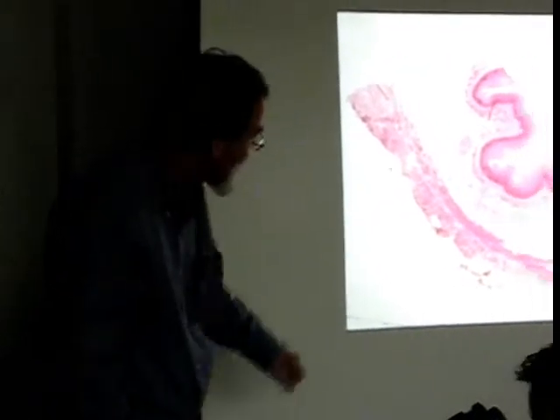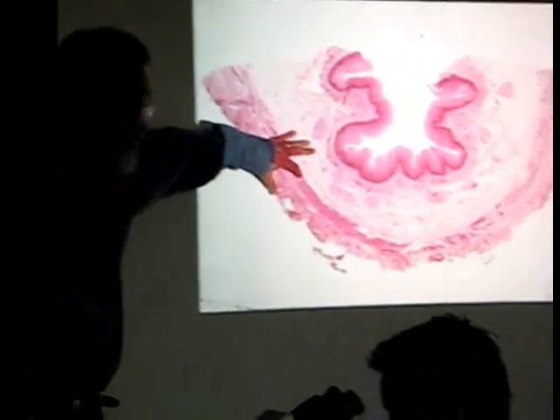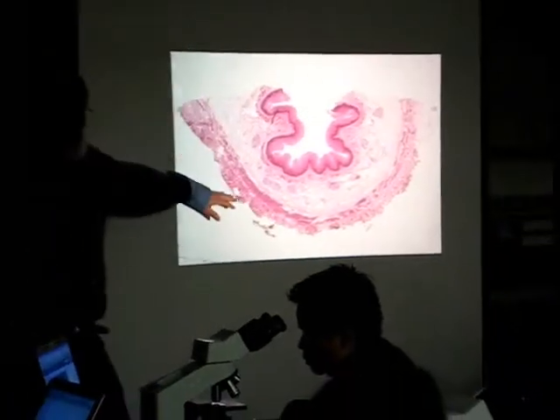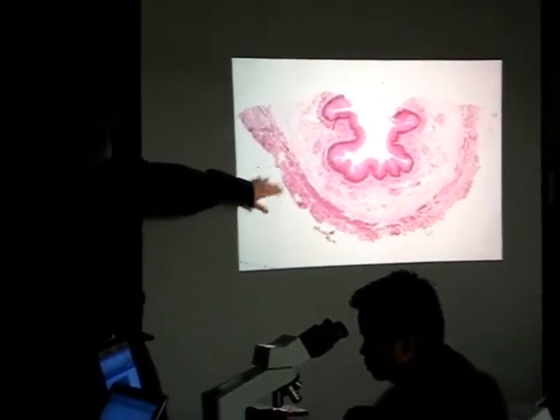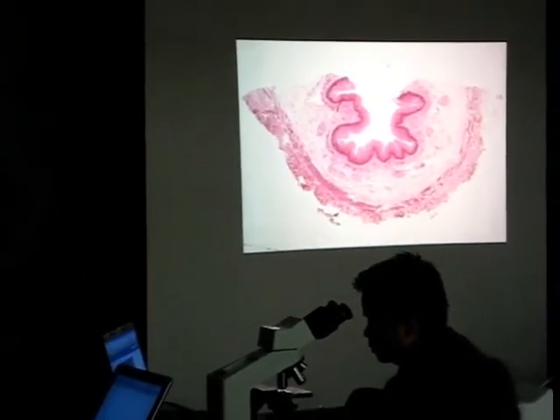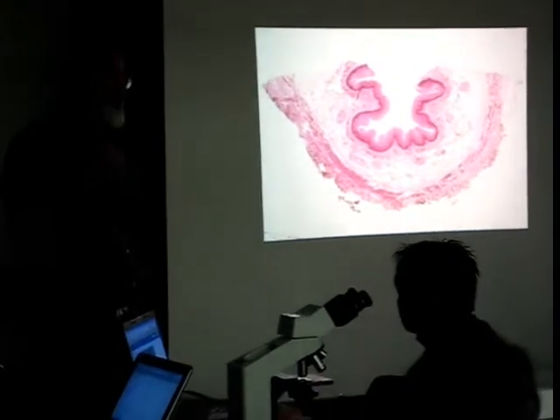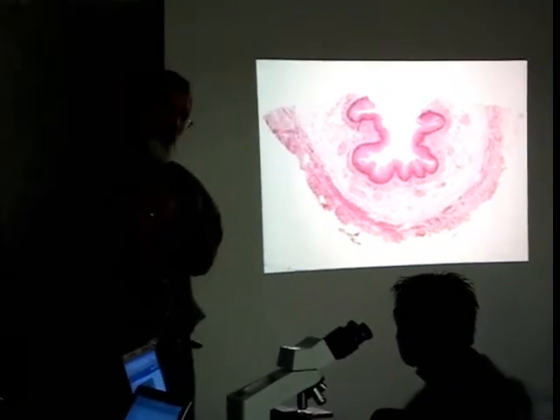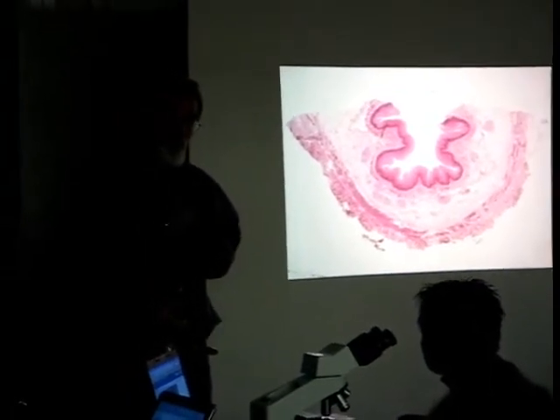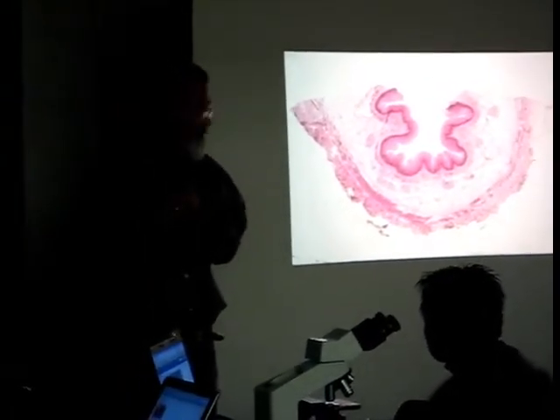And then clearly we've got the muscularis propria out here, and you can see that it's essentially ripped out of the connective tissue. So this would be adventitial. In reality, the esophagus throughout its whole length is adventitial, except when it punches through the diaphragm into the abdominal cavity right before it joins with the stomach. Then you find the serosal surface. All right?